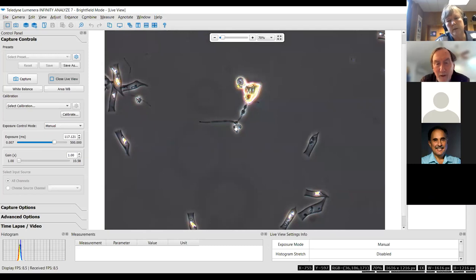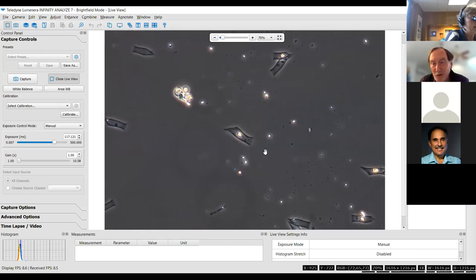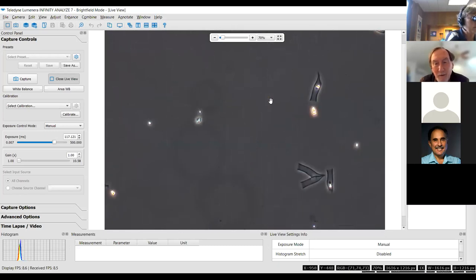Are there any there with the cells popping out the top? Because that's another thing that happens. It looks like an ice cream cone with the cell popping out the top. The problem is if it gets all the way out, now you've got the cell floating loose and you don't know what it goes to. Usually this is round. That's one of the monads that has popped out.